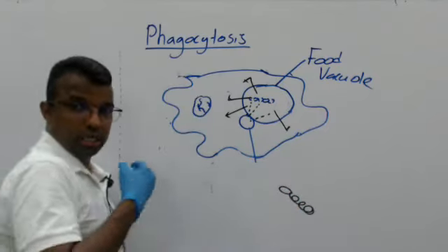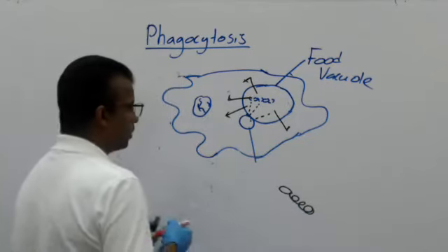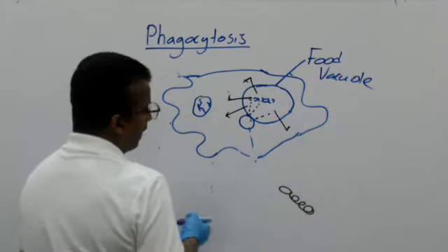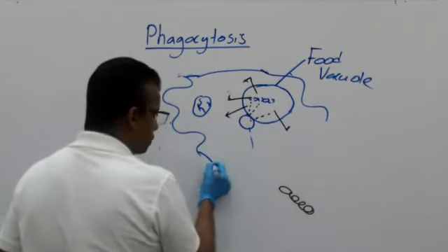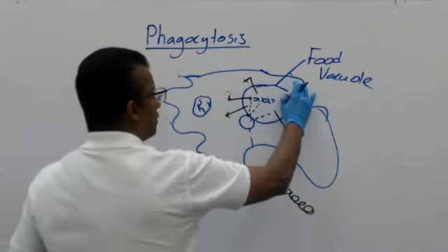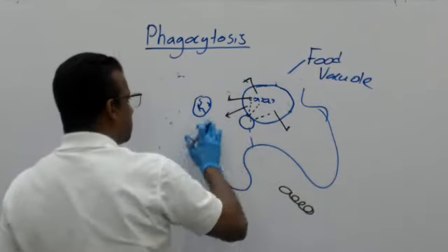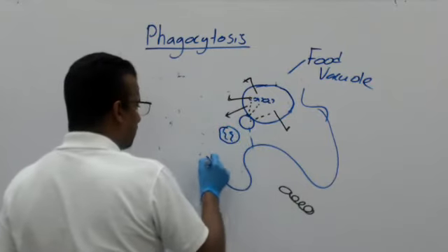And we know the response of this amoeba is to move towards food. So what's going to happen now? Another change in shape. The pseudopodia forming in this direction. The amoeba will undergo a change in shape. I place the nucleus somewhere here.